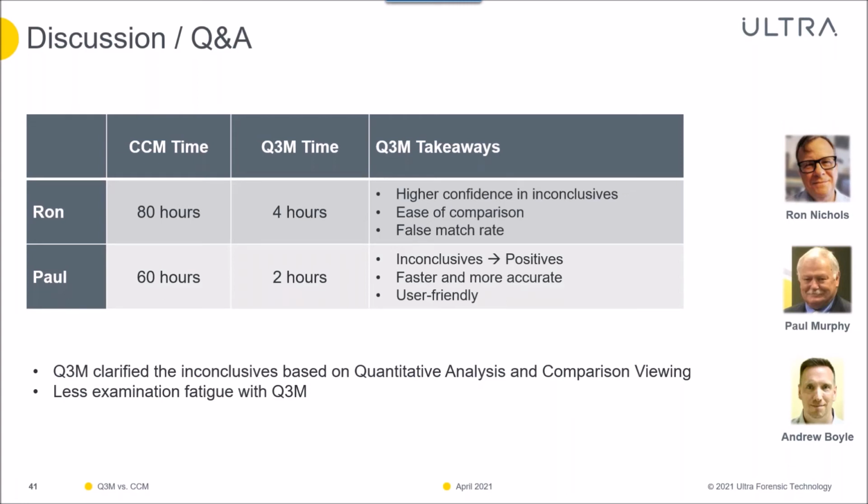I applied the quantitative analysis right in the beginning. I first looked at the quantitative analysis, and then based on that, I looked at the high score values, and then I called up the images on a comparison viewer.